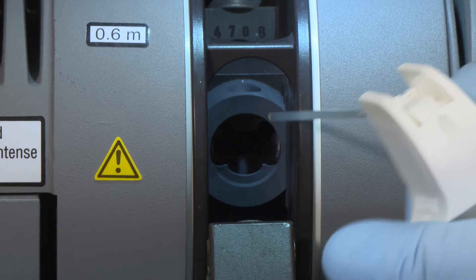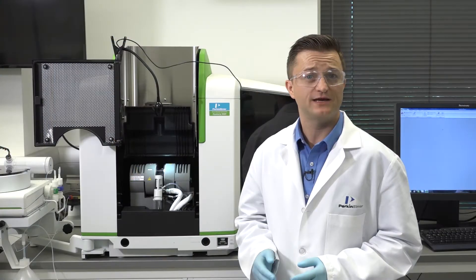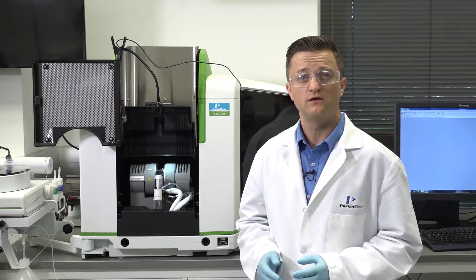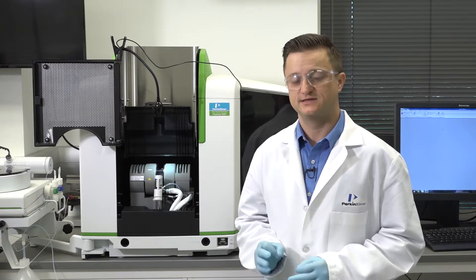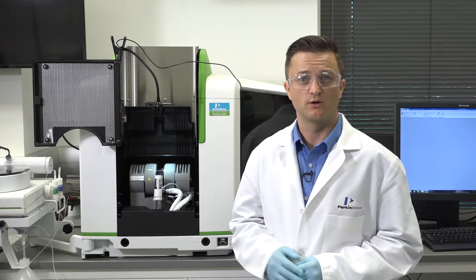Be careful not to scratch the inner surfaces of the contacts. If you notice that the surfaces of the contacts are pitted or cracked at all, remove the contacts and install new ones. You can purchase these directly on the PerkinElmer website.